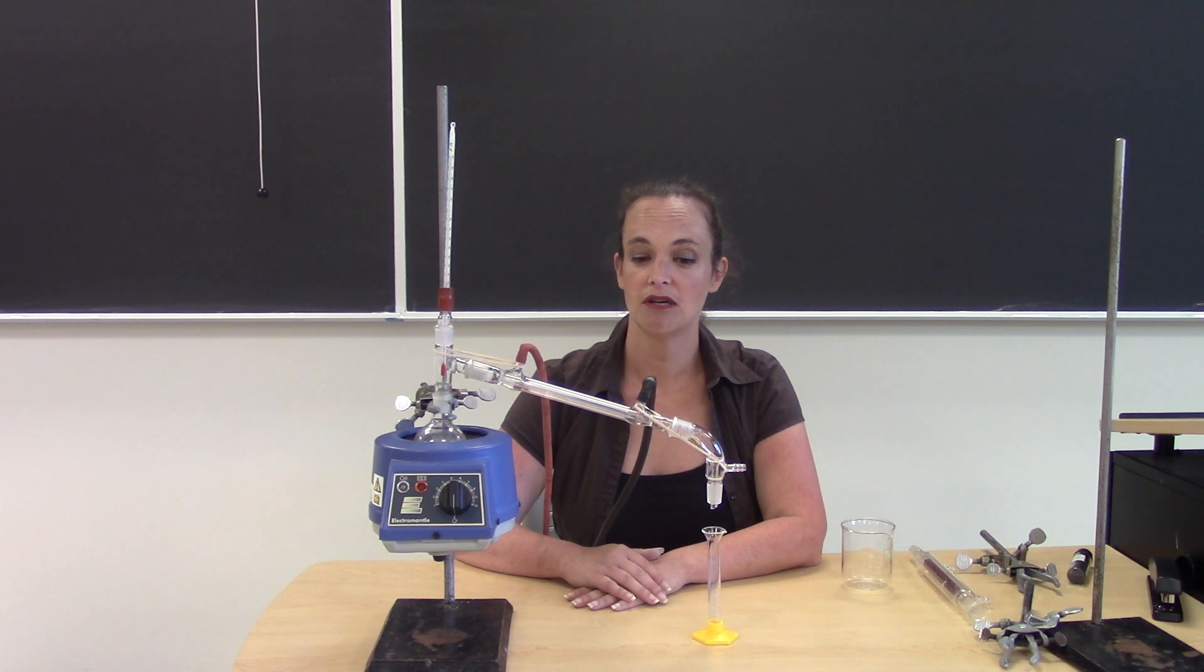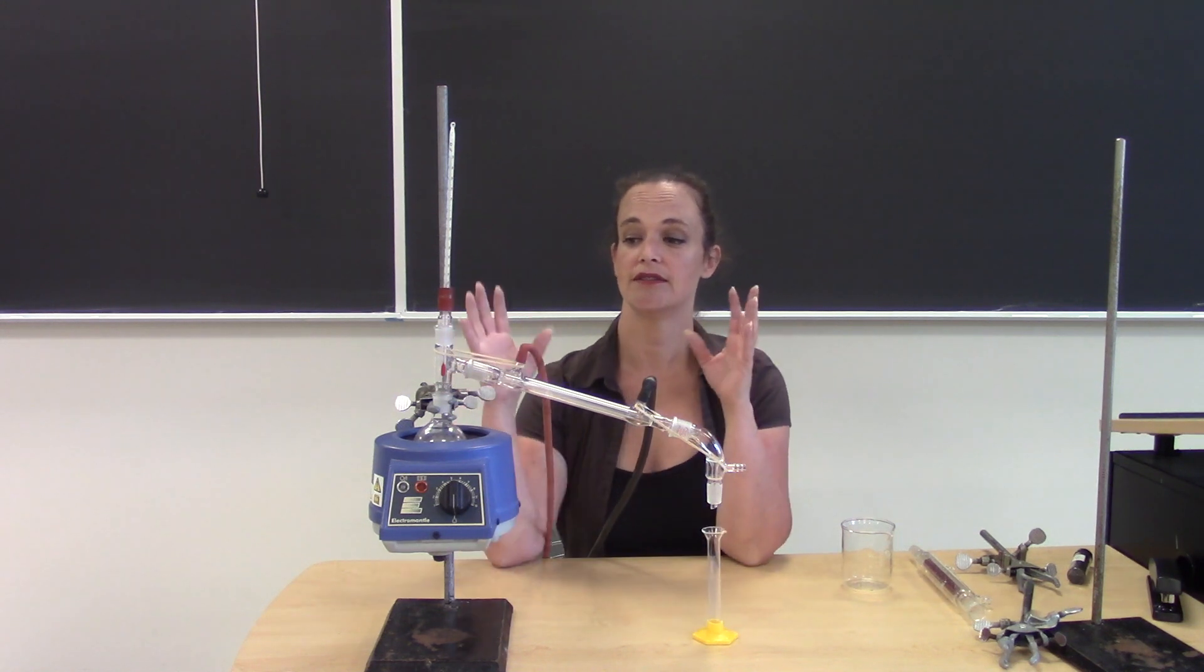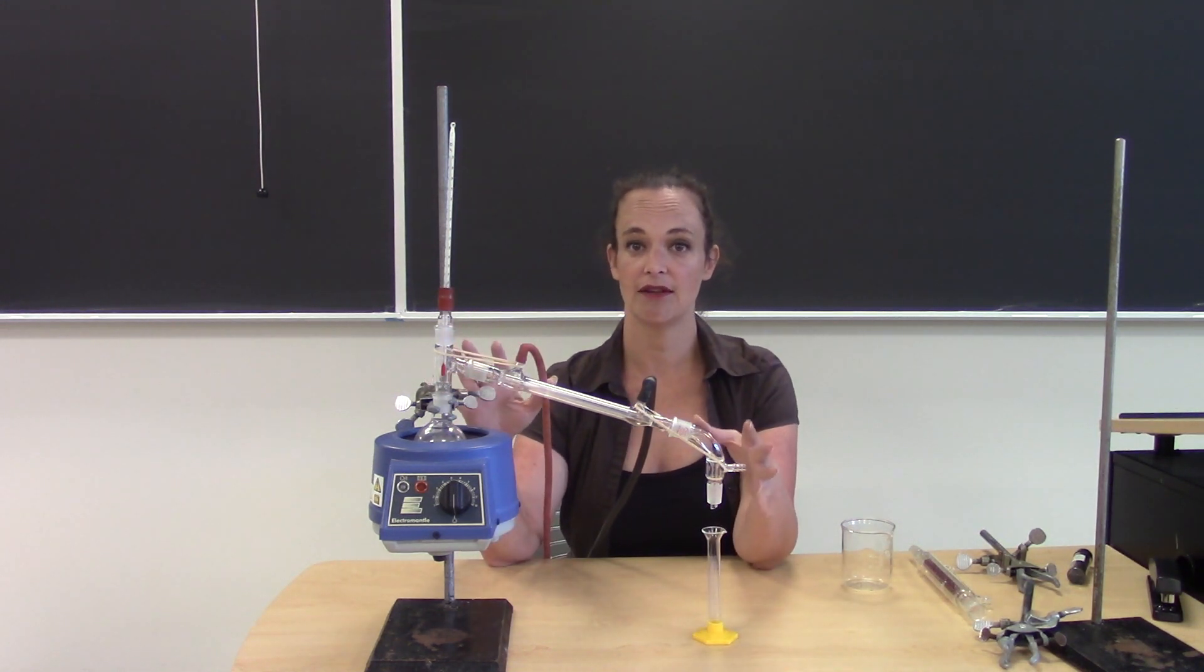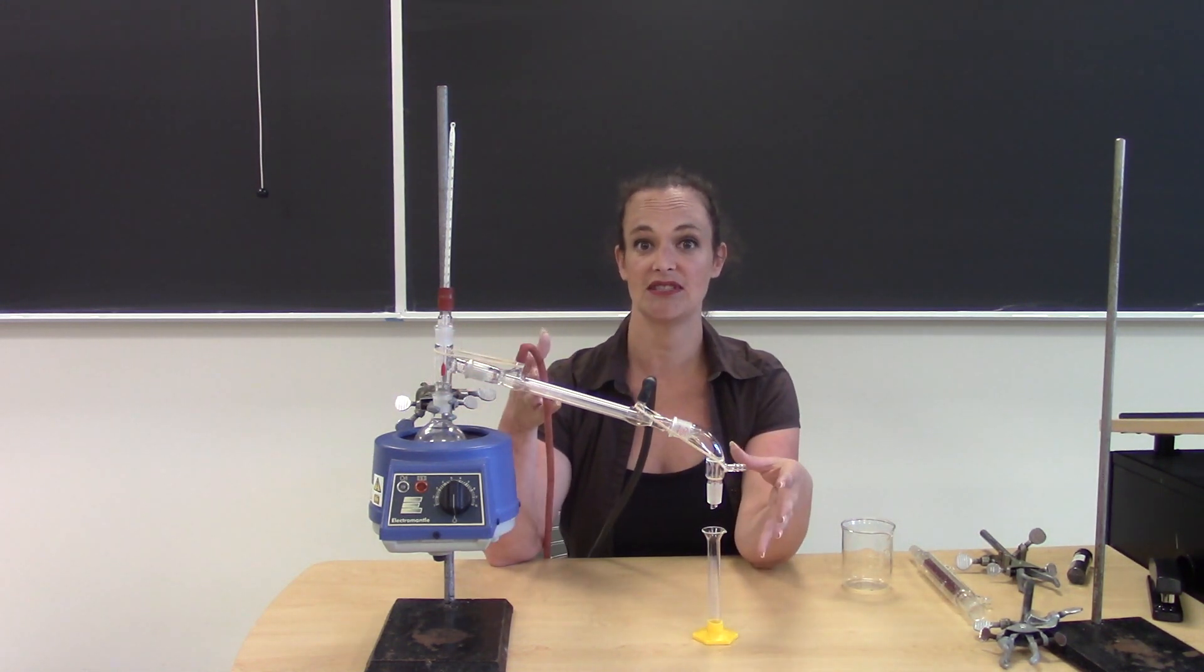This week in lab, you are going to be setting up and performing either a simple or a fractional distillation. And this setup that I've put together right here is your simple distillation.